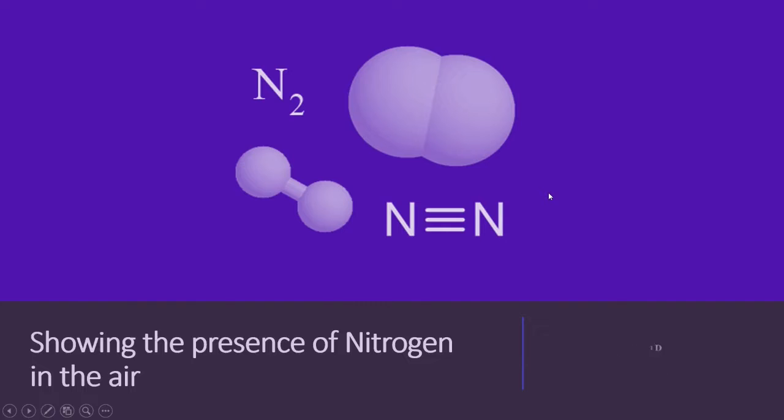Hello dear students, today we are going to study how to show the presence of nitrogen gas in the air by a simple experiment. Let's look at the characteristics of nitrogen gas.